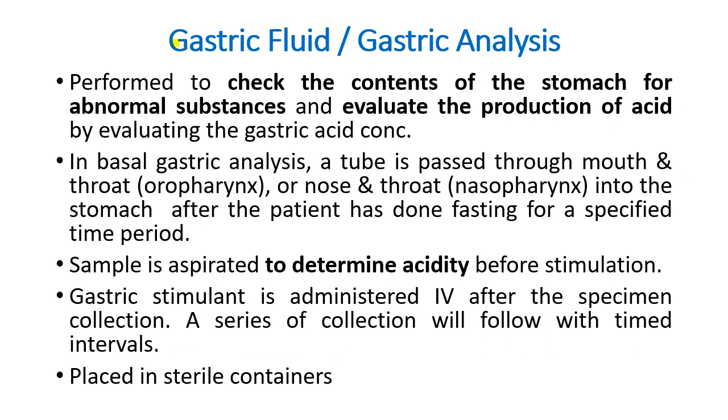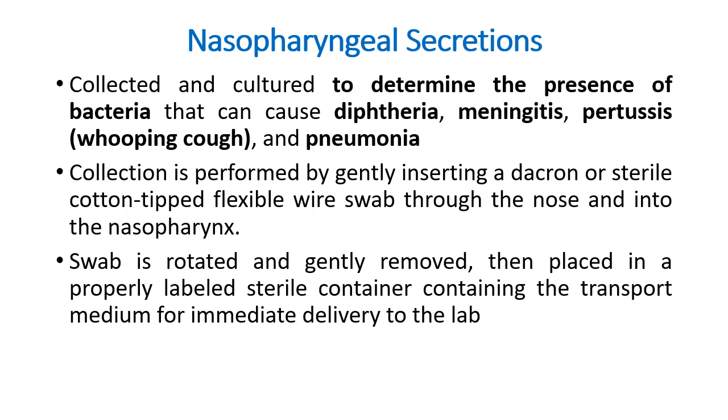We also have gastric fluid or gastric analysis. It is used to check the contents of the stomach for abnormal substances and evaluate the production of acid. So the sample is aspirated to determine the acidity before stimulation. So merong gastric stimulant administered IV after the specimen collection. So a series of collection will follow with time intervals. So lahat naman yan kailangan nakaplace sa sterile containers.